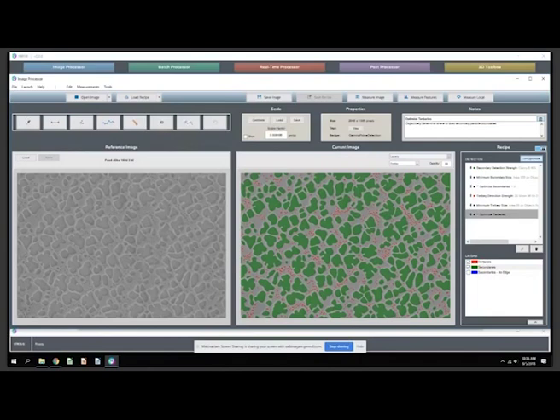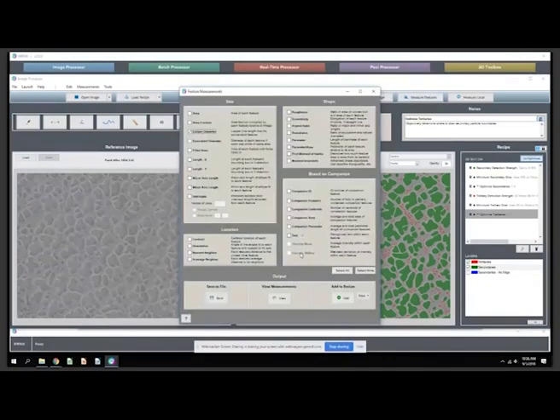The cumulative size distribution is something that our users usually do in other plotting software once they have the histogram from MIPAR. We are working on adding additional plotting enhancement features to the software in the 2.0 series.